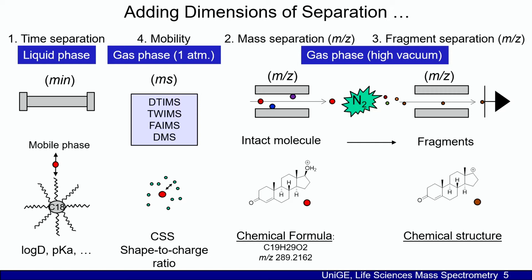Nowadays, commercially available IMS systems, like what we have seen in the previous session, include drift time IMS, TWIMS, FAIMS, DMS, and trapped ion mobility. Each of them works on a different operating principle. For those not familiar, I will again provide some basic principles of how they work. What we can distinguish between these collisional cross-section based devices and DMS and FAIMS is the electric field they use, either low field or high field.